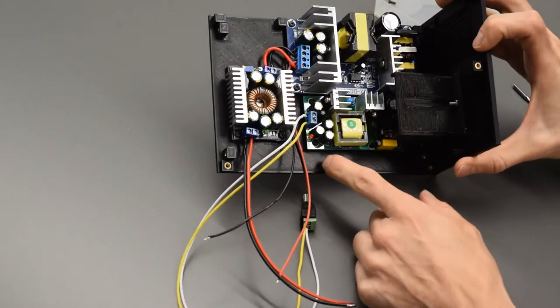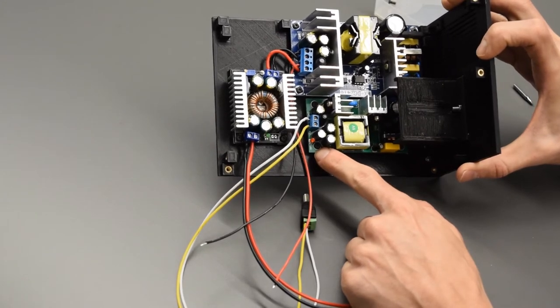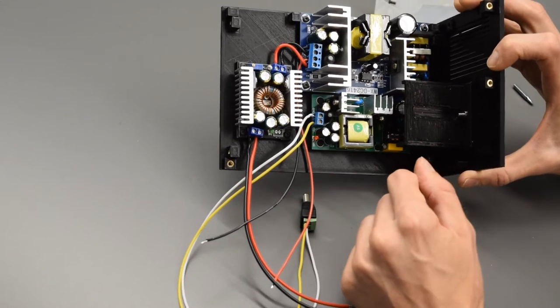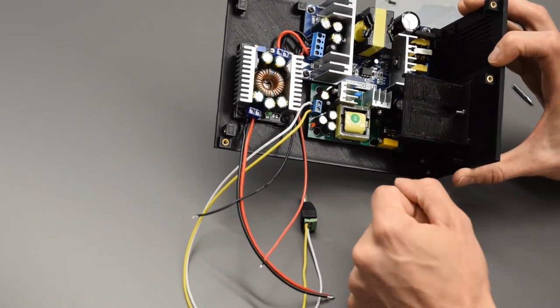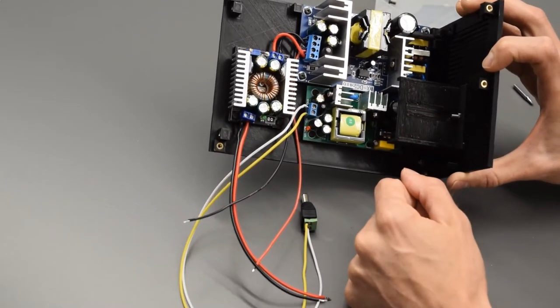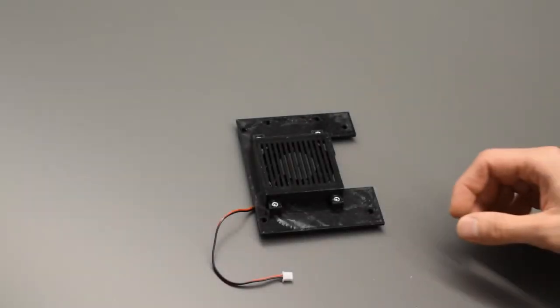I also just forgot to mention there's these other screws that I used, they're 6 millimeter pan or button head screws. And those should all fit right in. I think I got a bad heatset insert that didn't quite line up correctly, so I skipped one screw, but even two or three in each of those will be perfect to hold them in place. So next we've got the fan wall here.